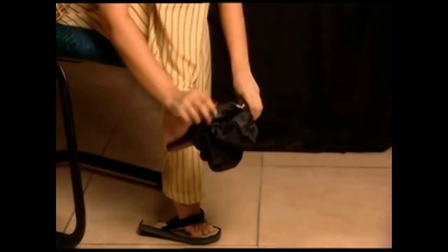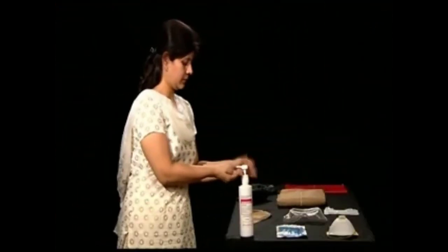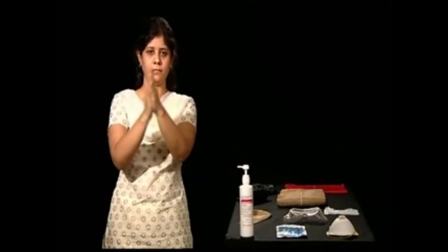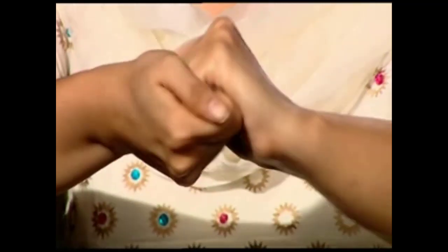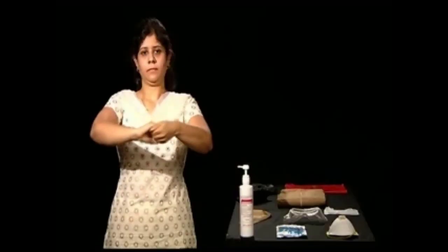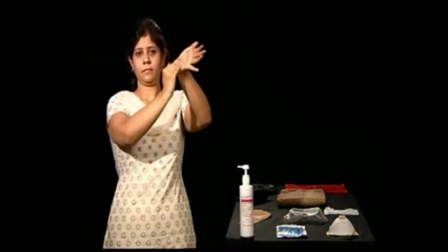At every stage as you discard each item of PPE, it is advisable to perform hand hygiene as it reduces the risk of coming in contact with contaminated substances. If the medical worker observes that hands have become visibly contaminated at any stage of PPE removal, they should be washed immediately before proceeding any further.